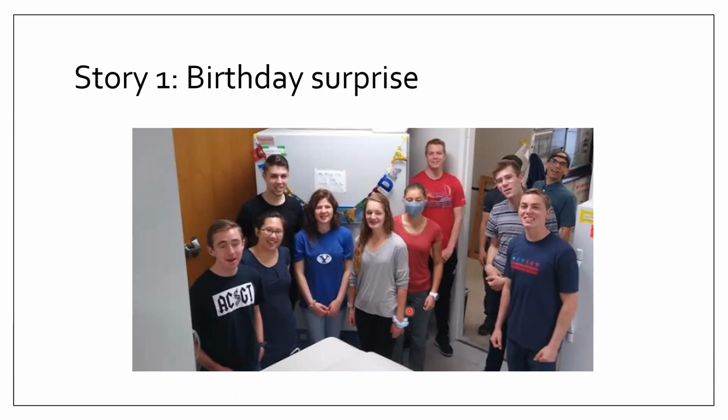So let's stop here again. Why is the -80 so important? Because all our mouse experiment samples are there, the stock of stock, and we don't want to mess that up.